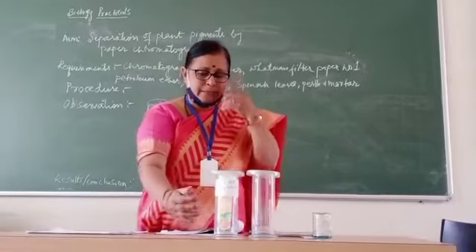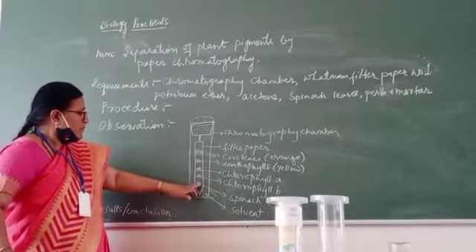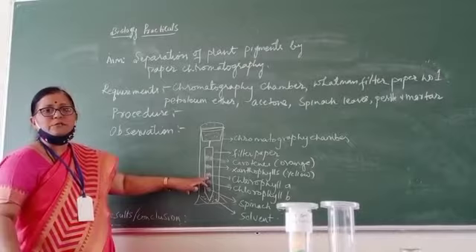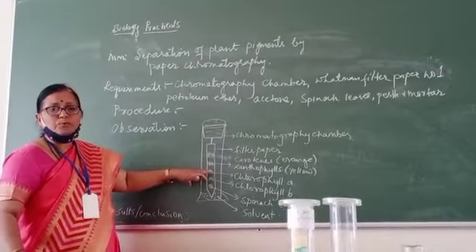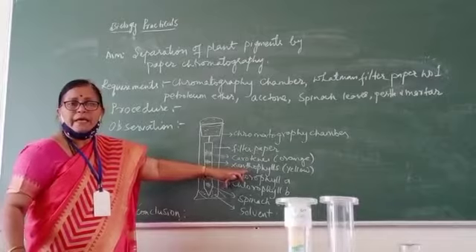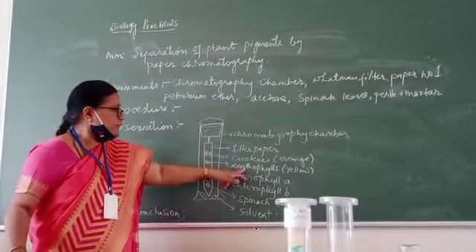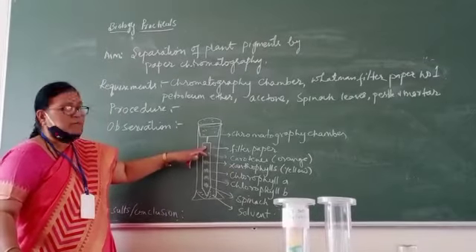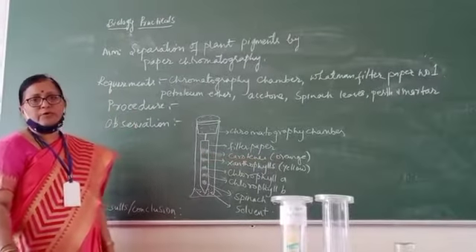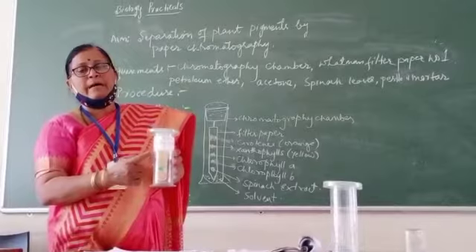This is the exact setup of the experiment. As the solvent moves upward, the denser pigments stop first — chlorophyll B is very dense, so after moving a certain distance it will stop. The solvent continues moving, carrying other dissolved pigments further. At another point, chlorophyll A will stop its movement. Then at a further point, there will be a yellow region — that is xanthophyll. Further still, carotene forms a yellow-orange band. Like this, on the Whatman filter paper, you will find various bands.